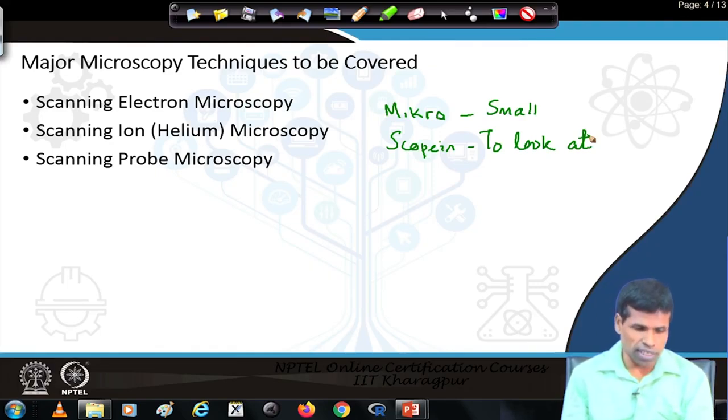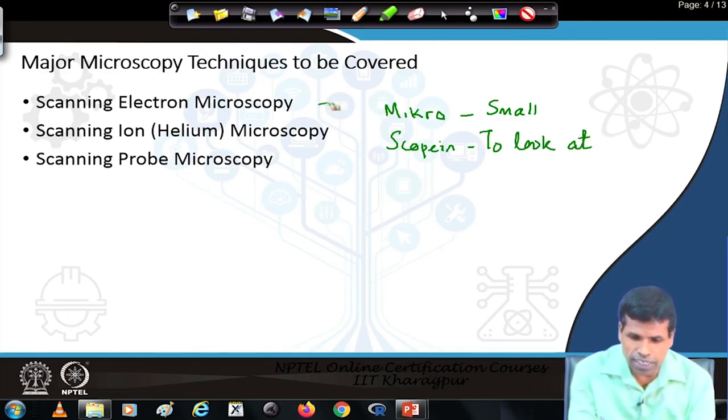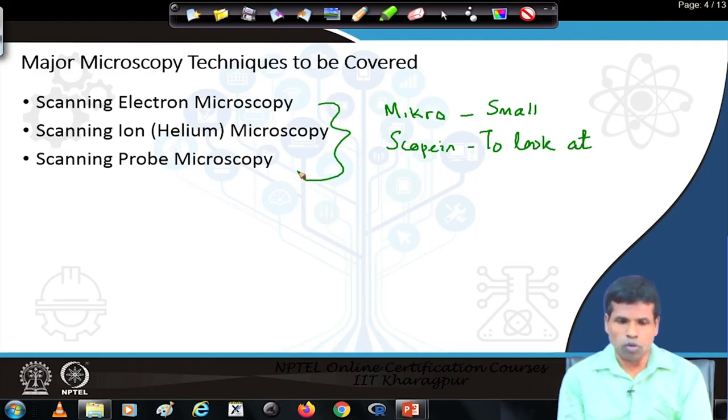Then the first word is scanning. Scanning means running or systematically moving a probe, which can be a focused ion beam or a focused electron beam, on the surface of an object to produce an image. Therefore, we say scanning. In this case, we use either an electron or ion probe to visualize an object or create an image to know its shape, size, morphology, etcetera. All these three techniques give us a three-dimensional image, and in the nanometer scale, less than 1 nanometer.